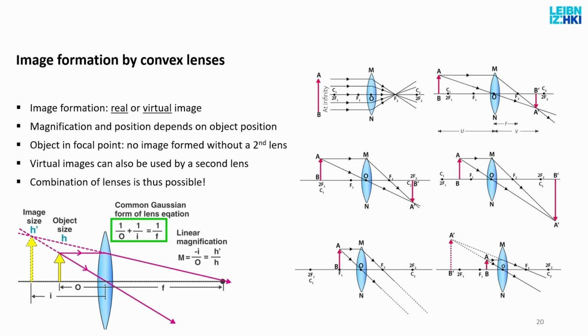But if you have a camera with a teleobjective lens, the focal distance, when you look at the markings, say 300 millimeters, for example. That works to take a picture of the Vienna Tower from here, but it will not work as an objective lens because the focal distance is too long.